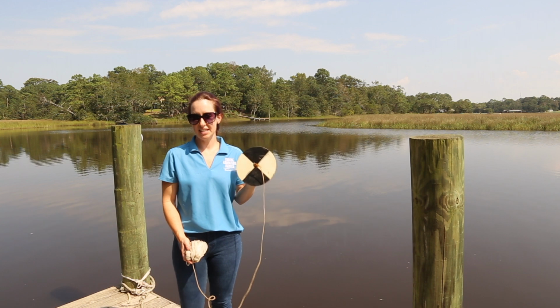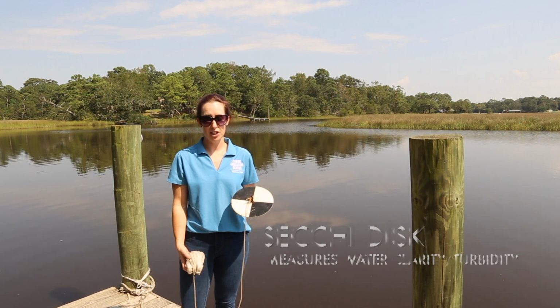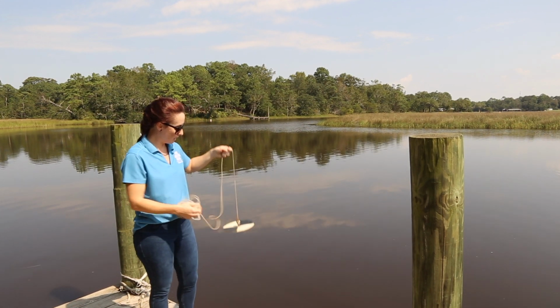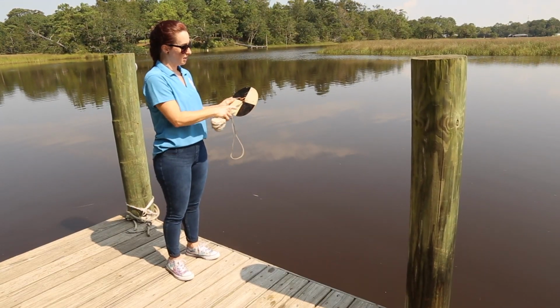Okay, so this is a Secchi disc. The Secchi disc is an old instrument that was developed in 1865 by Angelo Secchi. To measure the turbidity of the water, or the clarity, what we're going to do is lower this disc into the water, and we're going to continue to lower it until we can no longer see the black and white pattern on the disc.